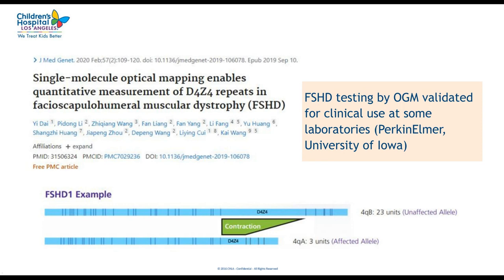And short-read sequencing also doesn't work very well because reads from repetitive regions cannot be mapped back to the genome. But optical genome mapping provides the advantage that you can directly visualize these repetitive regions in long DNA molecules, and you can really efficiently detect and study repeats. One well-known example are repeats associated with rare genetic disorders, facioscapulohumeral muscular dystrophy.